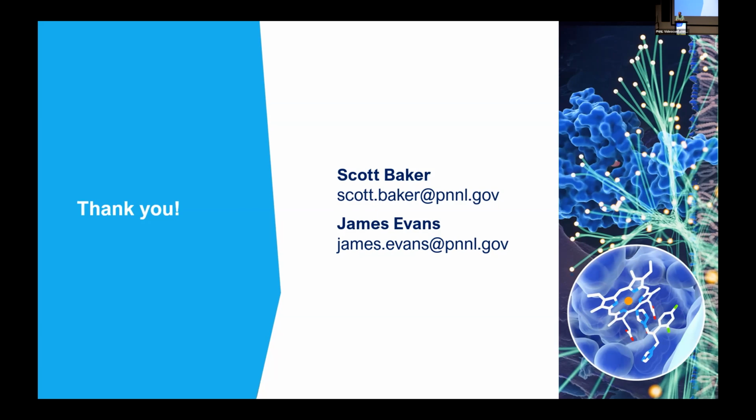Yeah, it's a great question. All of these capabilities are also available to anybody else. The cryo-EM, NMR, cell-free expression, native mass spec, and so forth, everything that I talked about here, anybody can request based on their user project. The 1,000 fungal proteins is part of a larger strategic goal called DigiFen, which is trying to do a much larger scale focus on pretty much most types of BER-relevant science. 1,000 fungal proteins is a smaller version of DigiFen, trying to demonstrate that on a more focused target.